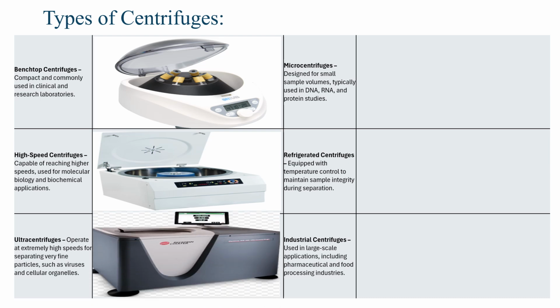Now next one is the ultracentrifuge. Ultracentrifuges operate at extremely high speed, which enables the separation of very fine particles like viruses and cellular organelles. They generate immense centrifugal force, allowing precise fractionation of biomolecules for advanced research and analytical applications, right?